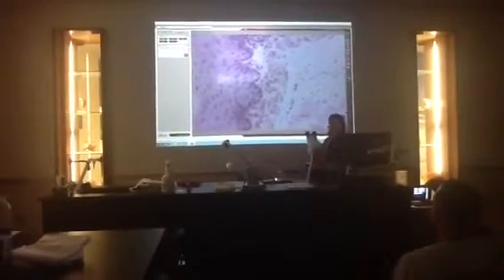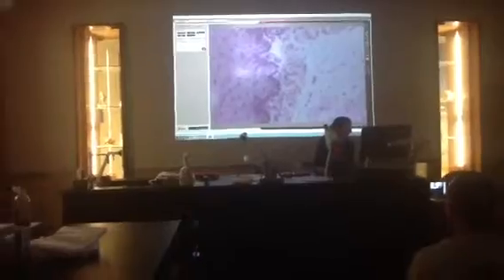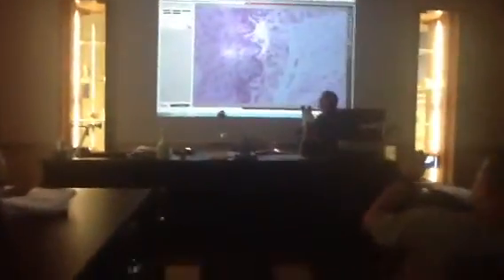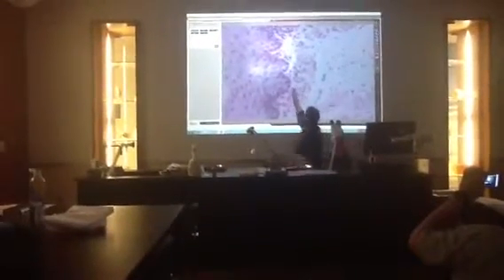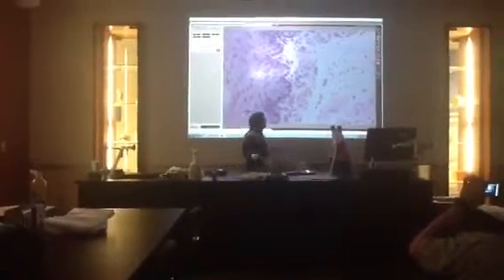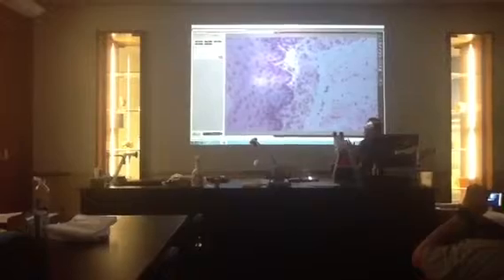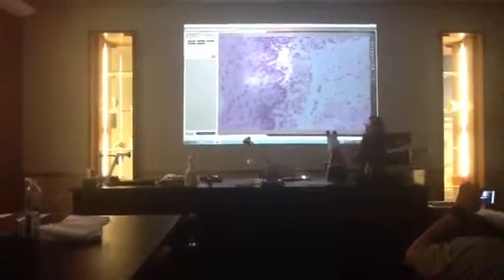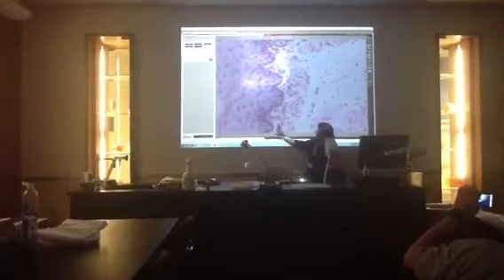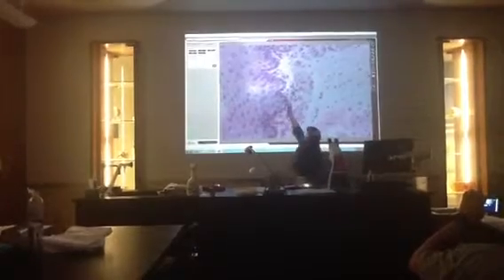Okay. So on the layers of the mucosa, again from here out is what? Stratified squamous. Now in here again, it's going to be very close as to which one it is. Right hugging that basement membrane of the stratified squamous right here is the lamina propria.